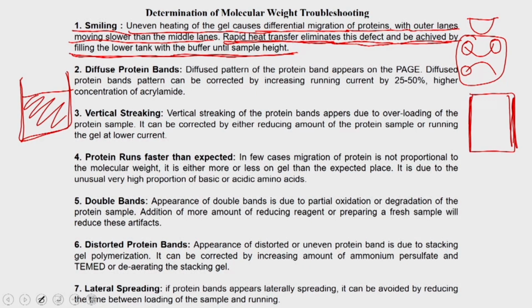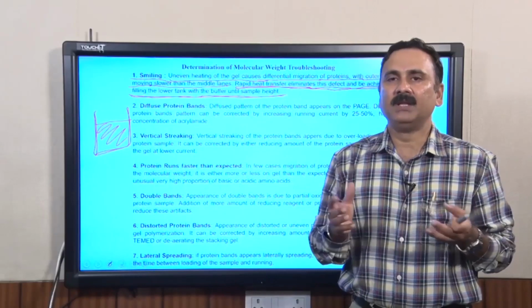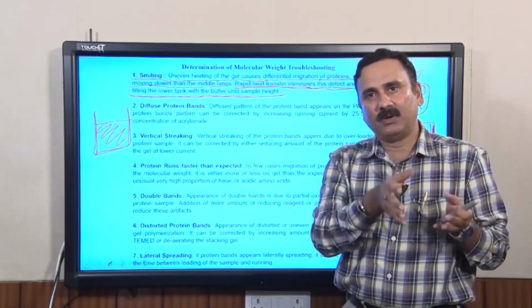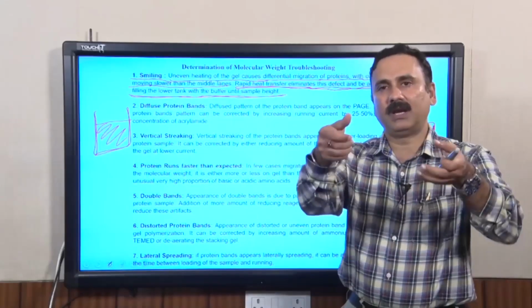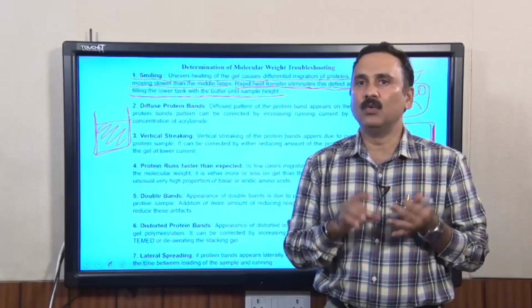And you can also recycle this buffer. If you see that the apparatus is getting very hot, then you can exchange the buffer, or you can put it into ice bags, so that the buffer which you are filling outside is very cold.